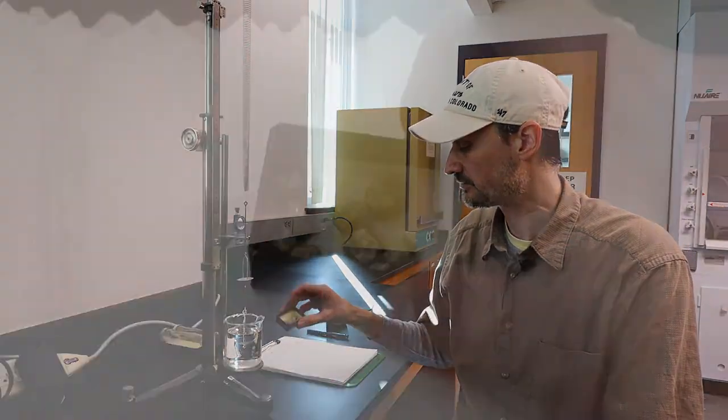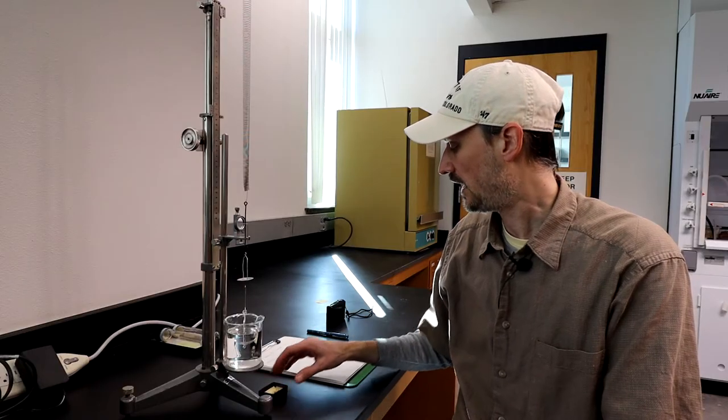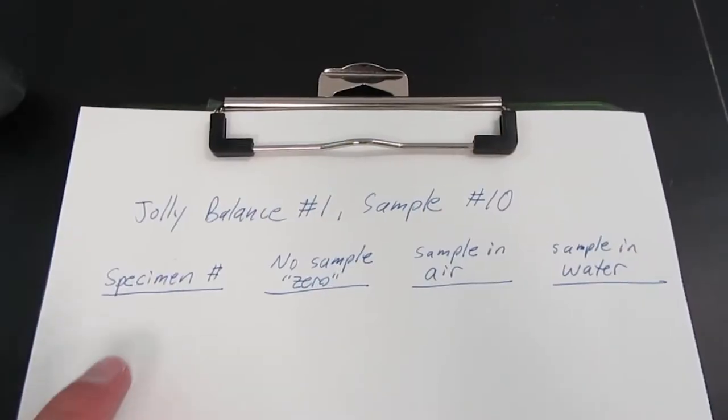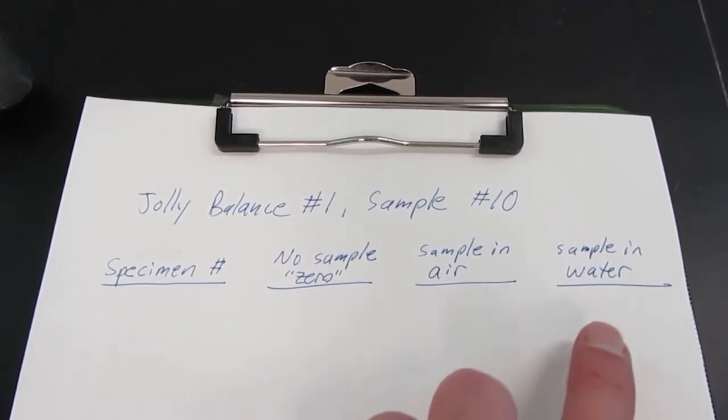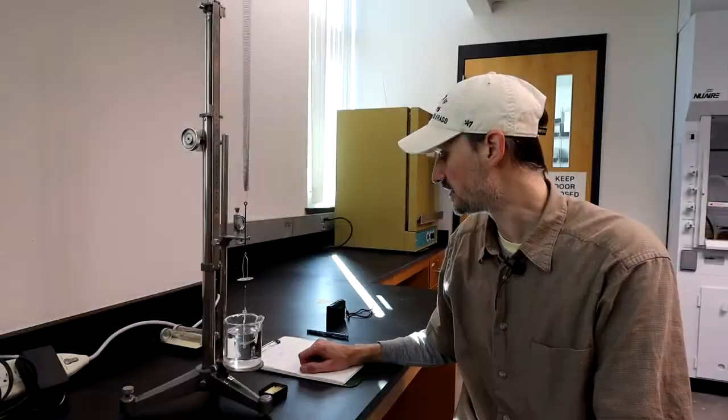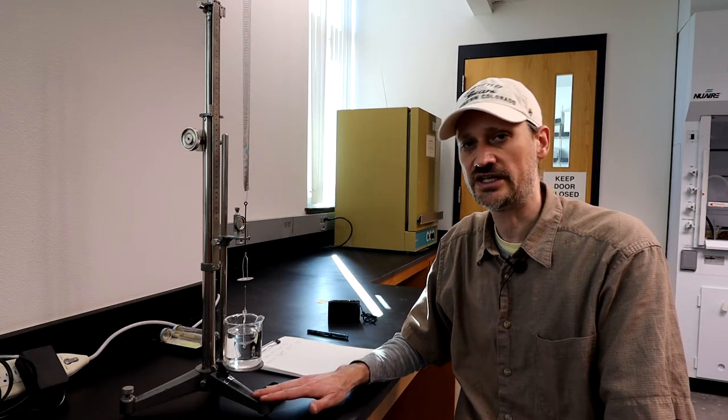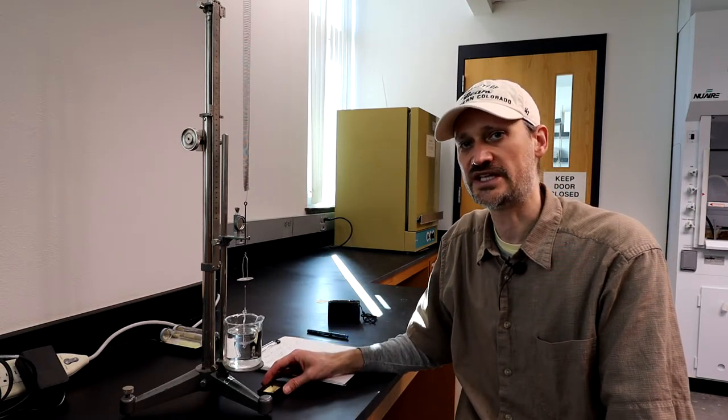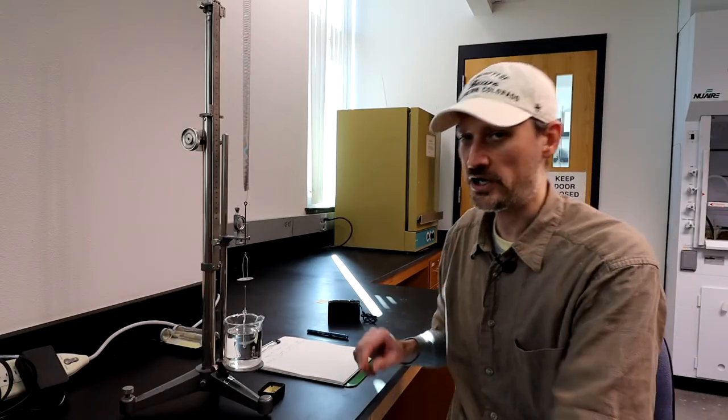I also have my specimen and a notebook. On that notebook I have specimen number, the zero measurement, the measurement for the sample in air, and the measurement for the sample in water. I also want you to keep track of which Jolly Balance you're using—in this case it's number one—and also keep track of which sample this is. In this case, this is sample number 10.